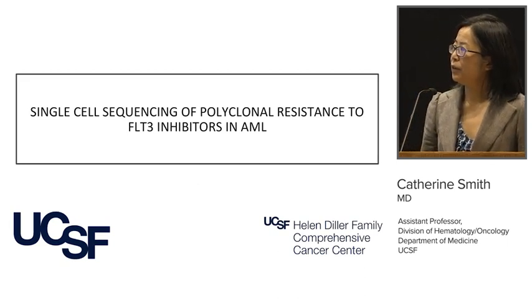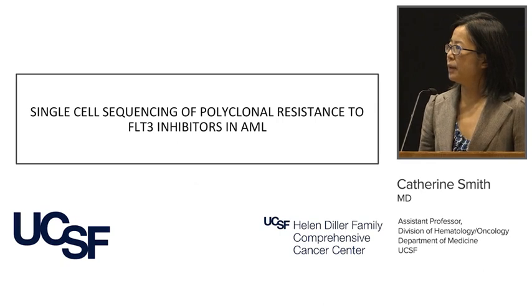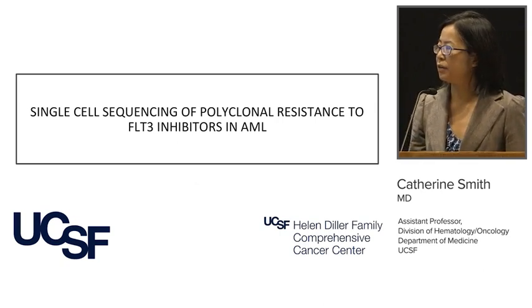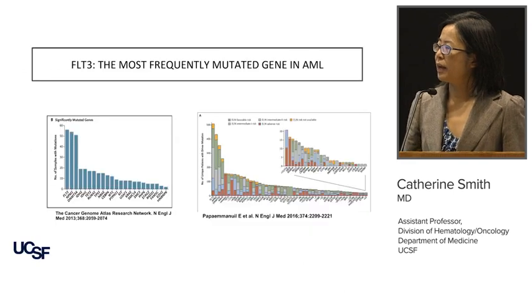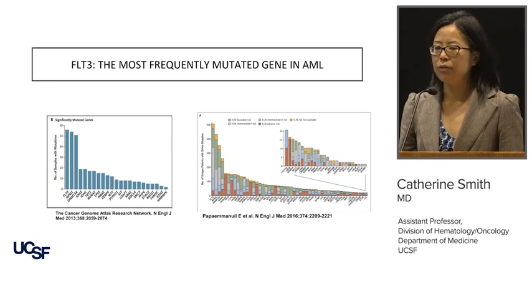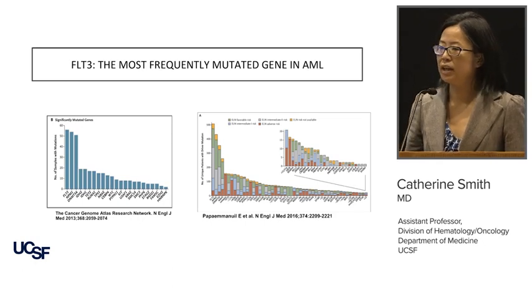So what we did was we used the Tapestri single-cell sequencing platform to examine polyclonal resistance mechanisms to FLT3 inhibitors. So I thought I'd start by providing a little bit of background on FLT3 in AML. FLT3 is the most commonly mutated gene in AML.